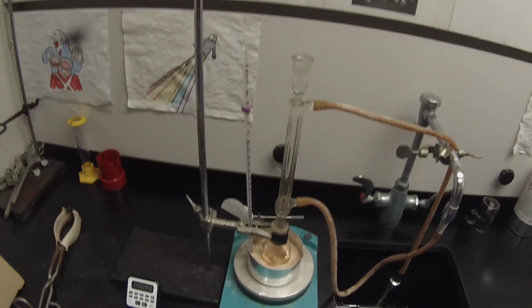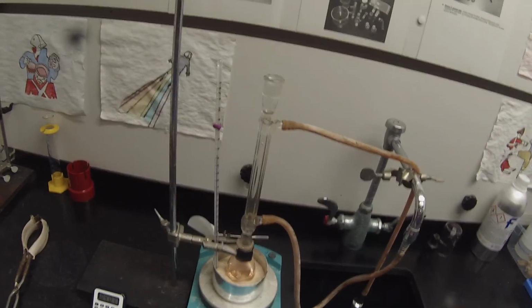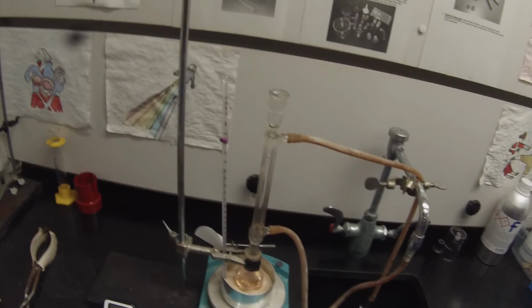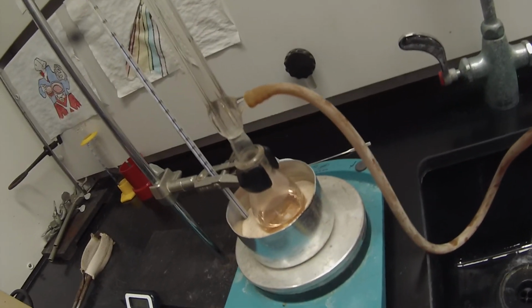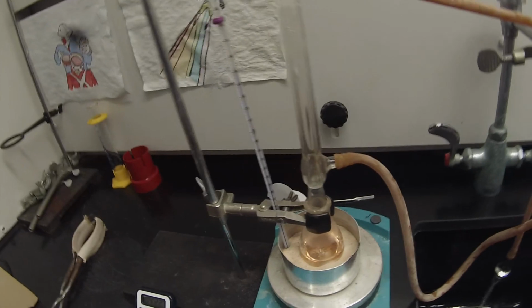The temperature of the solution should be at the approximately 140 degree boiling point of xylene, even though the sand bath says 153. It's not 153 uniformly through the solution. You can see that there's some condensate here as it evaporates.